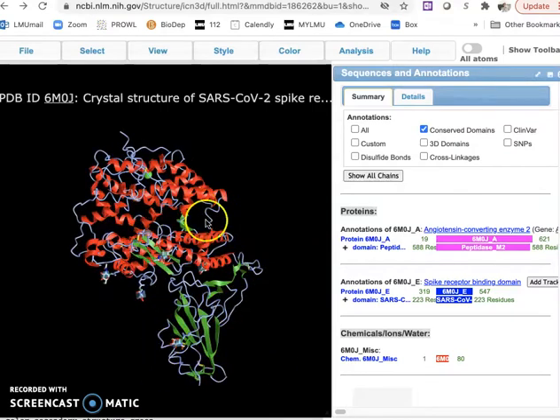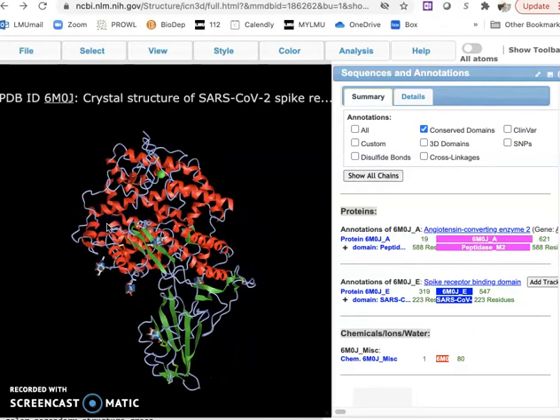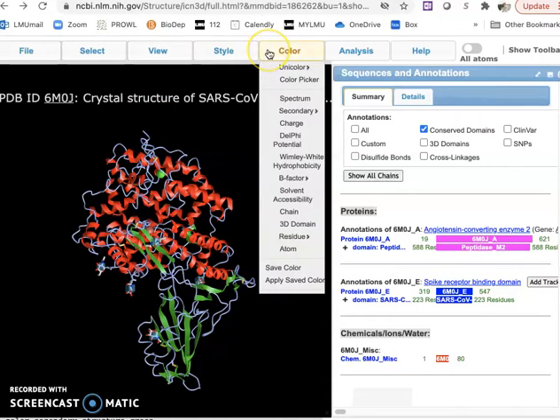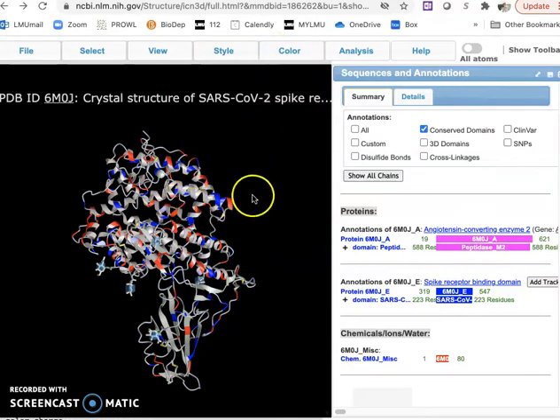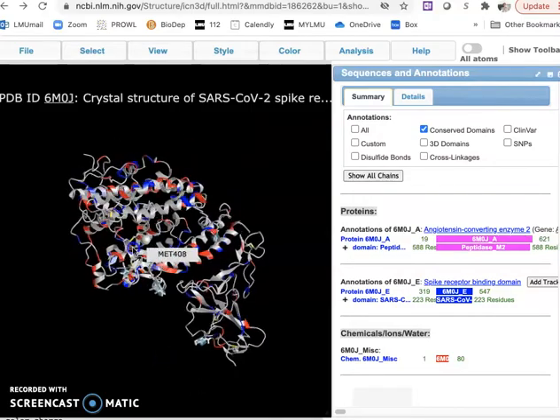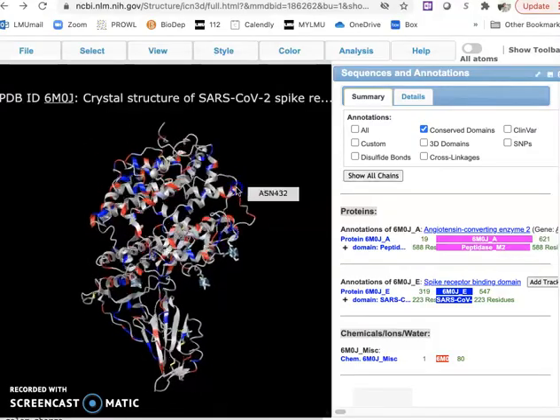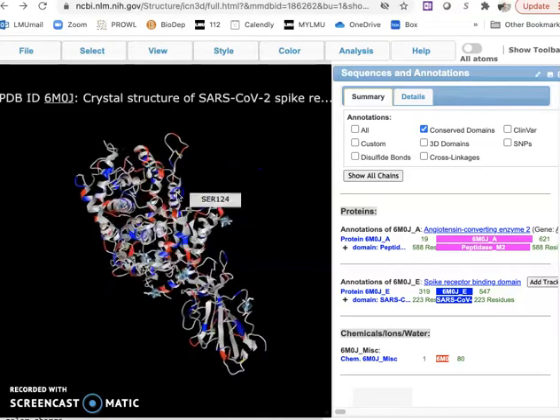The receptor protein has both sheets and helixes. Charge is an interesting feature if you want to see negative and positive charges and how they're distributed in the proteins. These are interesting when you look at the interactions and folding patterns.